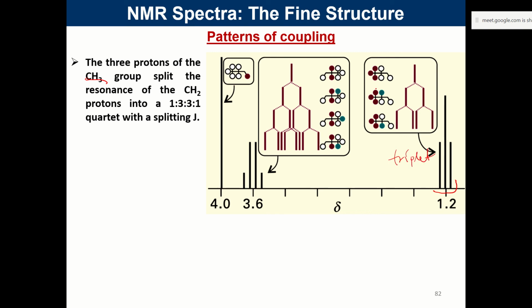So this dot, these 3, this is CH3 which is interacting with, so if this is my A, these 3 nuclei taken together is A, okay, and this is the AX consideration, and this is together as A, and this is X2, AX2 system.